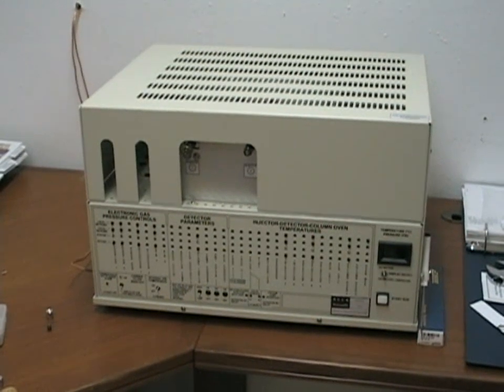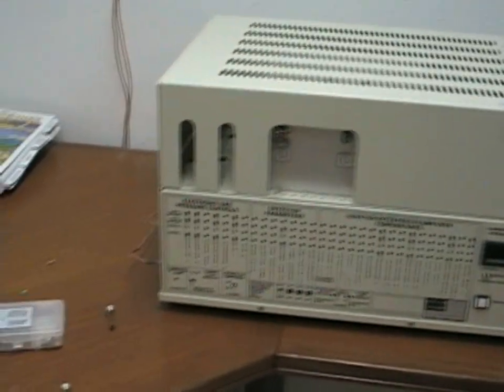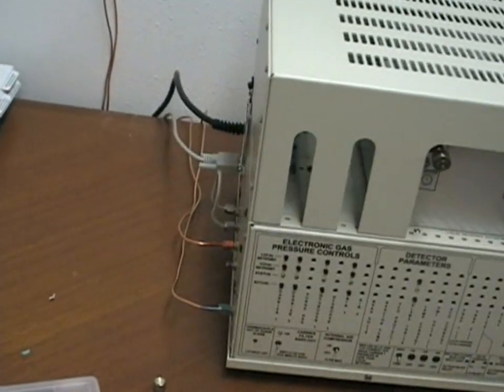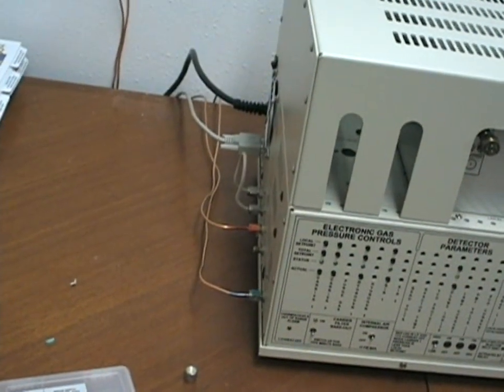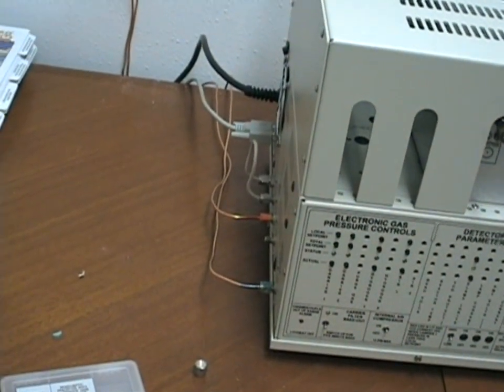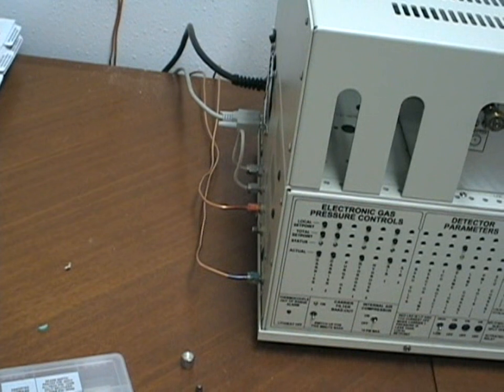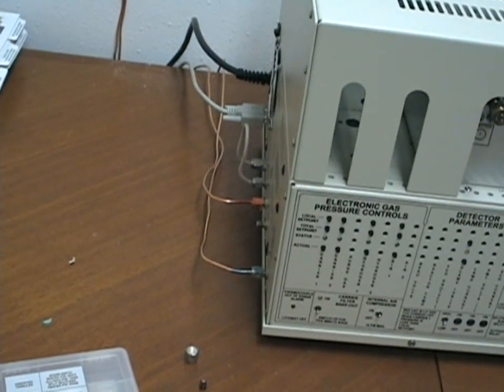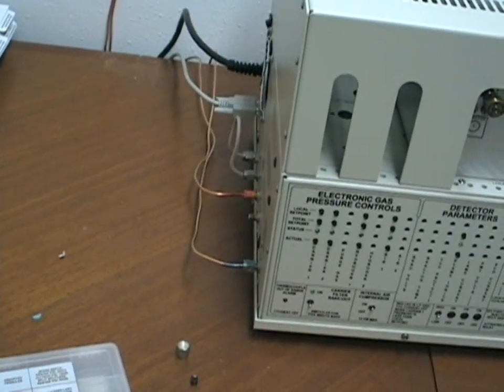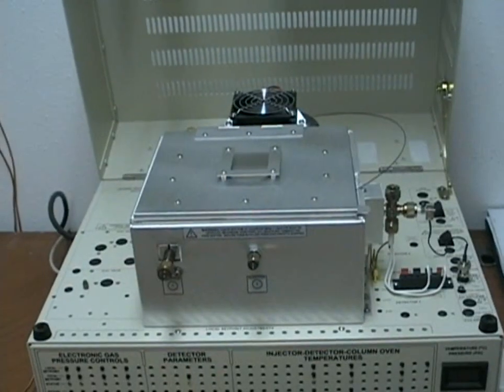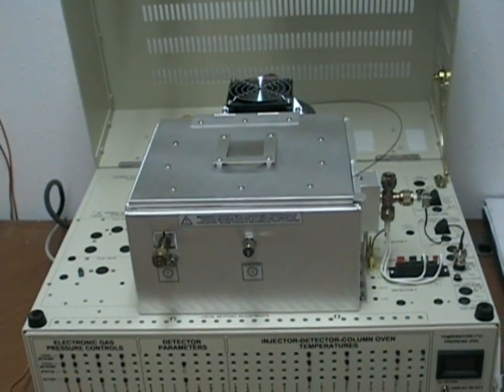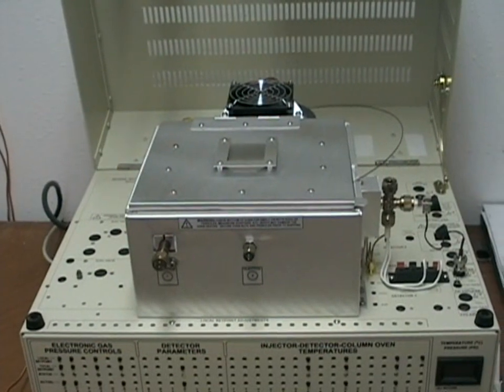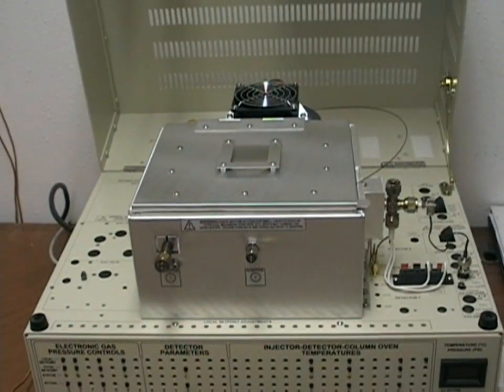The GC system requires hydrogen and helium gases connected to the left side of the GC to create the flame for the FID and provide the carrier gas for the system. Under the lid of the GC are your injection ports and the column oven.